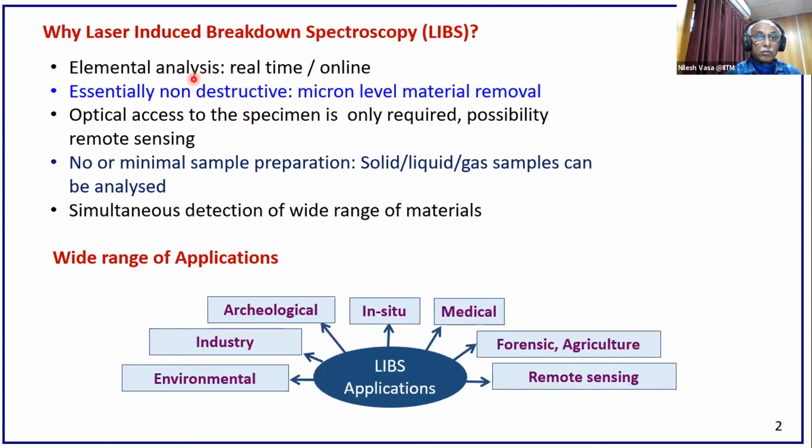And the advantage, and why we go with the LIBS technique, and why it became so popular. You can see that in the last 15-20 years the progress has been tremendous. Now there are some instruments which we are trying to implement in terms of online and real-time application, etc. So I'm going to discuss these aspects.